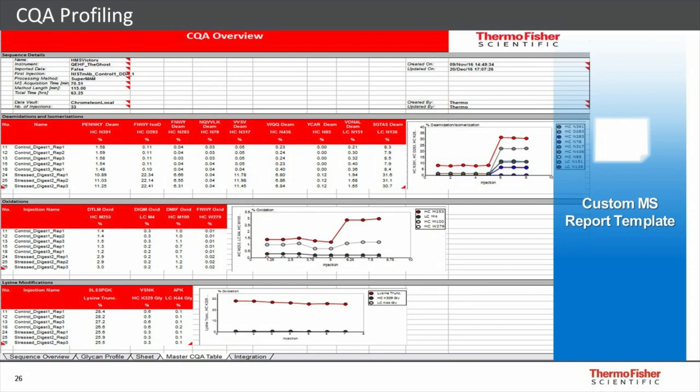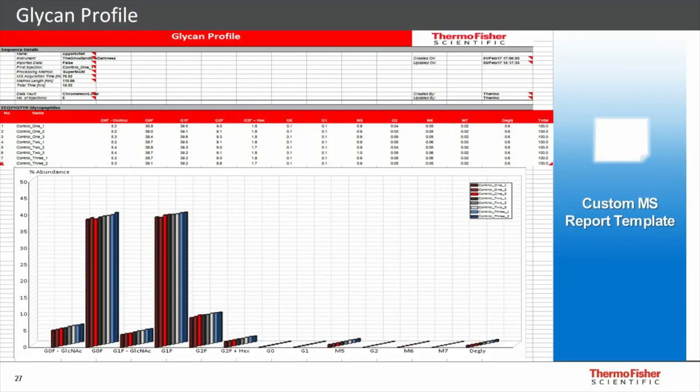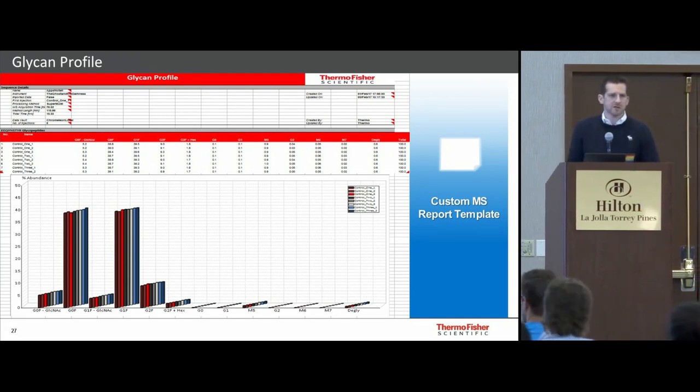It's overall consistent. This was a thermal stress of the sample, so deamidation and isomerization, of course, increased. Glycan profile, this didn't really change between any of the replicate digests. I really wouldn't expect it to. We were able to see some low ones, like M7, he's in there at about 0.02%. So we got the major 13. You can look for more. There's a couple more in there.